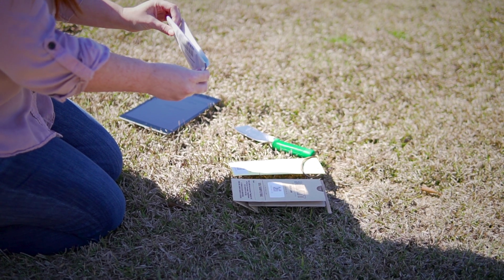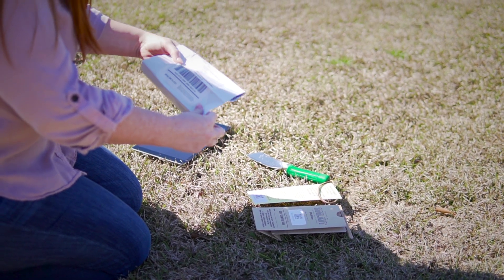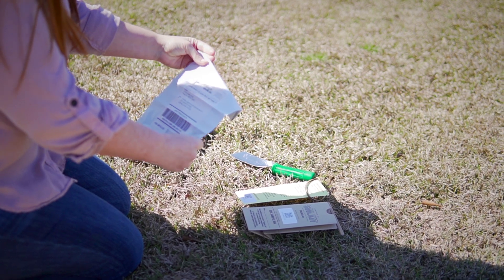While some soil kit packages come with a trowel, all soil kits come with a sample bag, prepaid mailing envelope, customer care card, and instructions.